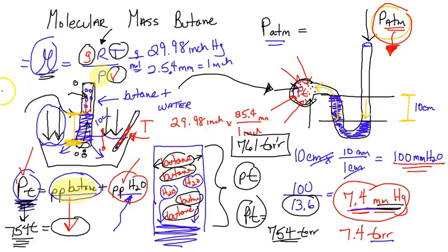And that's the lab. So make sure you stop and look back at it. It's employing the use of a manometer. It's employing the understanding of water being suspended in a column. We could eliminate some of this, and we'll talk about how we would.